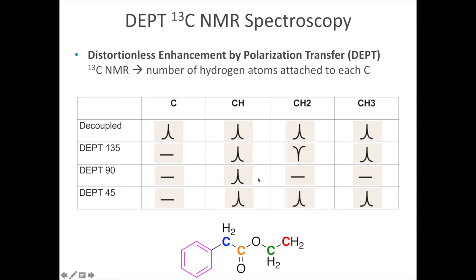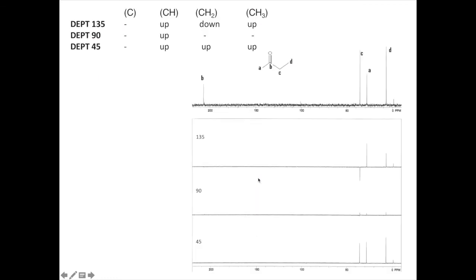Right? So let's do an example. We have here this ketone molecule, 2-butanone. First, we see the carbon decoupled spectrum. There are 1, 2, 3, 4 signals. Remember that there's always going to be a signal at or around 0, which is a standard. So that's the TMS. Okay, so let's analyze this here.